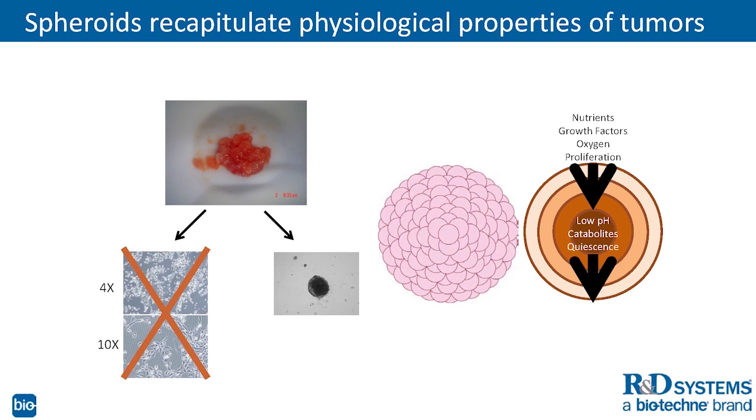And at the same time, within the core of the spheroid, these cells are producing catabolites. They're producing waste products. It's a low pH, very hypoxic environment, and we have the same problem where everything that's produced within the core of the spheroid has to diffuse out, and that's this bottom arrow. It's just showing how these are diffusing out, and as a result, we get heterogeneous cell populations where the cells in the core, in this very toxic environment, actually become necrotic or apoptotic.